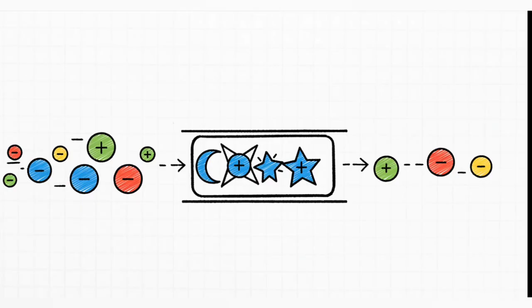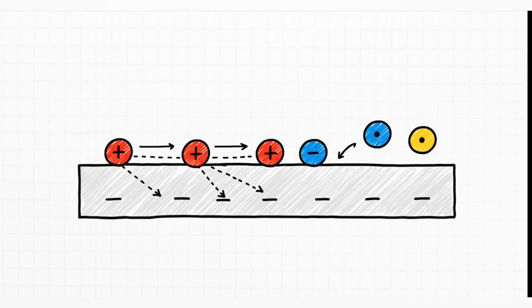To make this even easier, let's just think of the whole system as a molecular sorting gate. Imagine this tiny little gate that's designed to only let certain things through while catching others. In science, this gate is called the stationary phase, and you can think of it as being coated with a kind of molecular Velcro. As the whole mixture of molecules flows past, this Velcro grabs onto any particle that has the opposite charge and just lets everything else wash right on by.